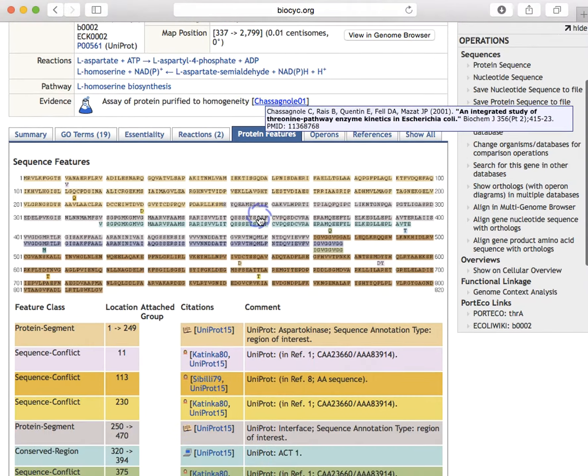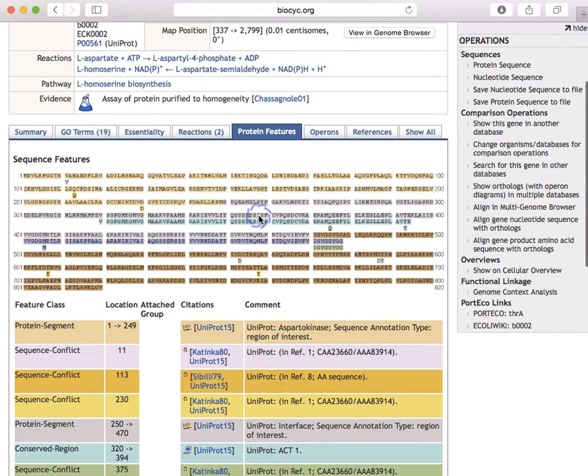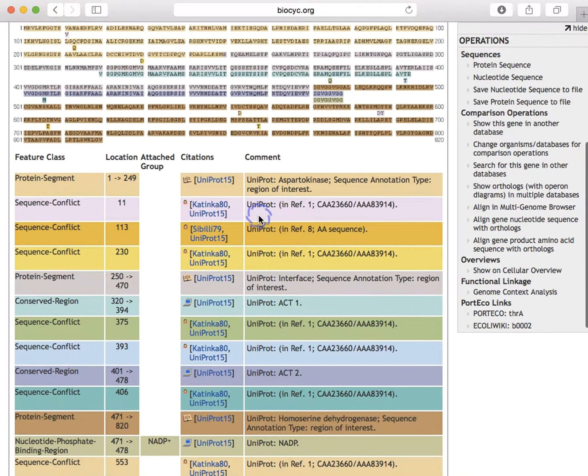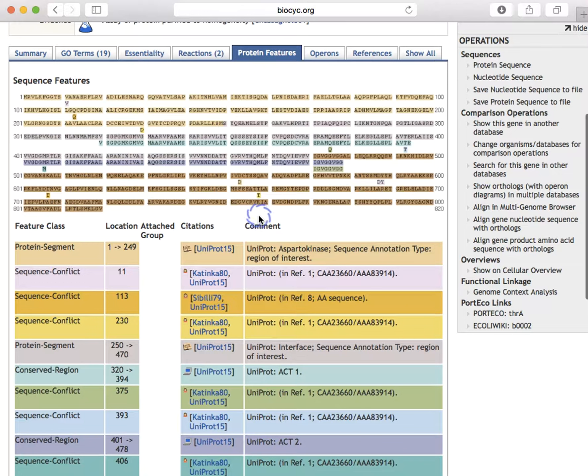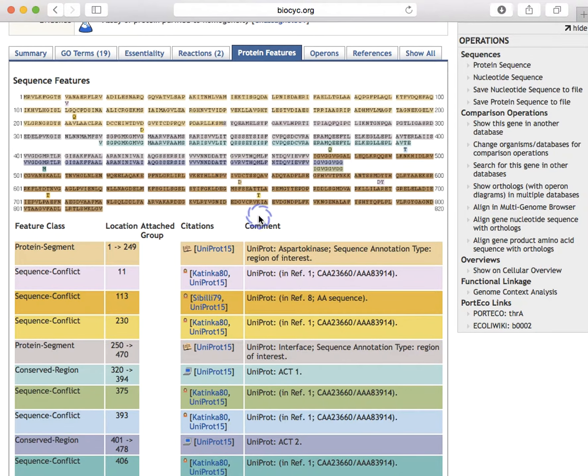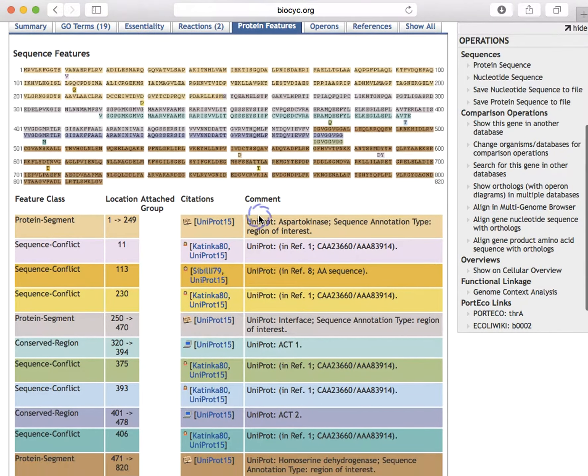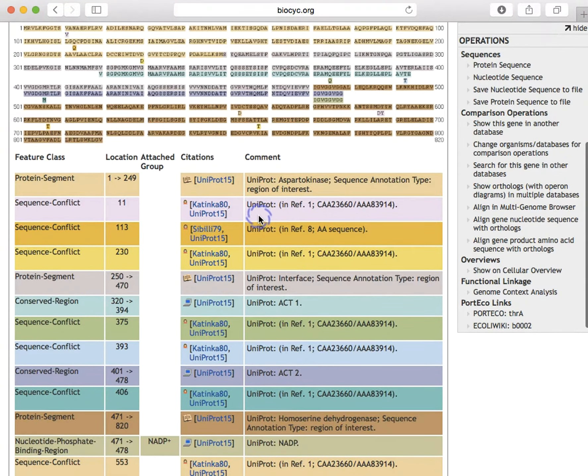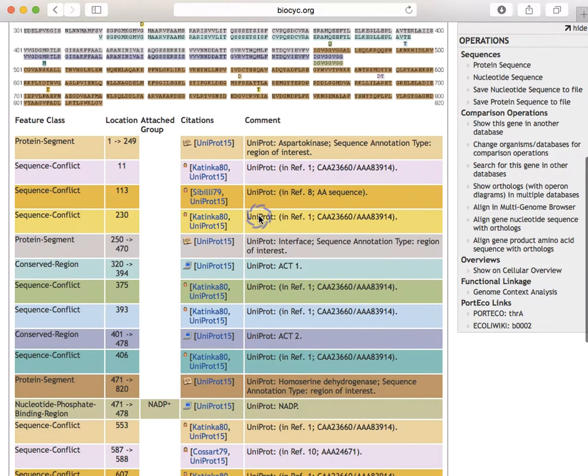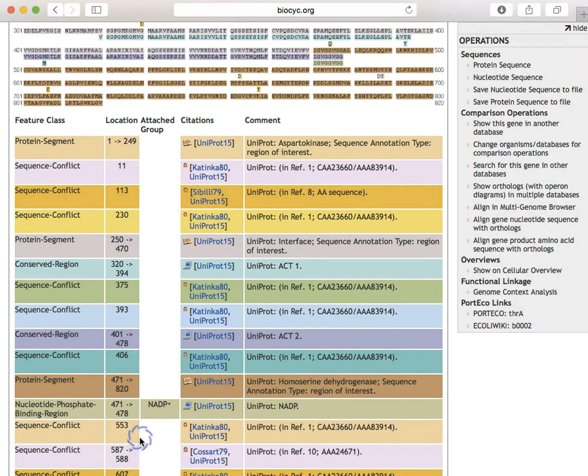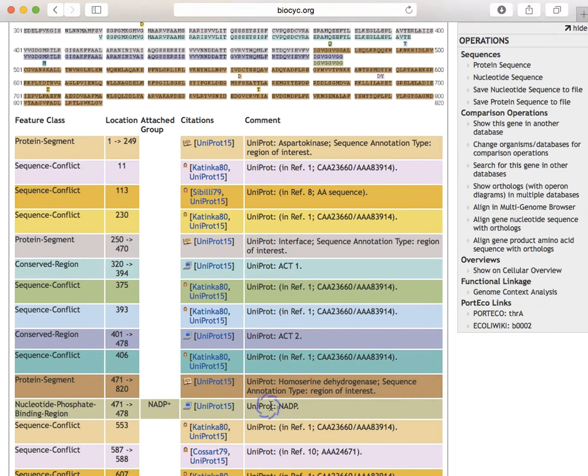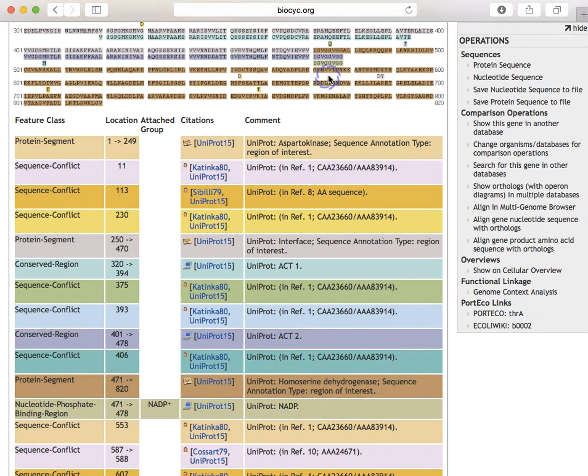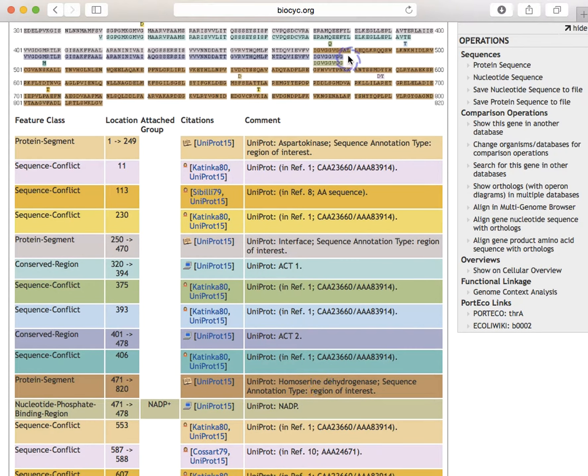The protein features pane colors the protein sequence at residues of interest that have been annotated. This protein has many sequence features and it contains a nucleotide phosphate binding region at residues 471 to 478, which is this line. This information came from UniProt, and it's shown right up here as this gold-colored section. The same color is used to highlight those residues here.